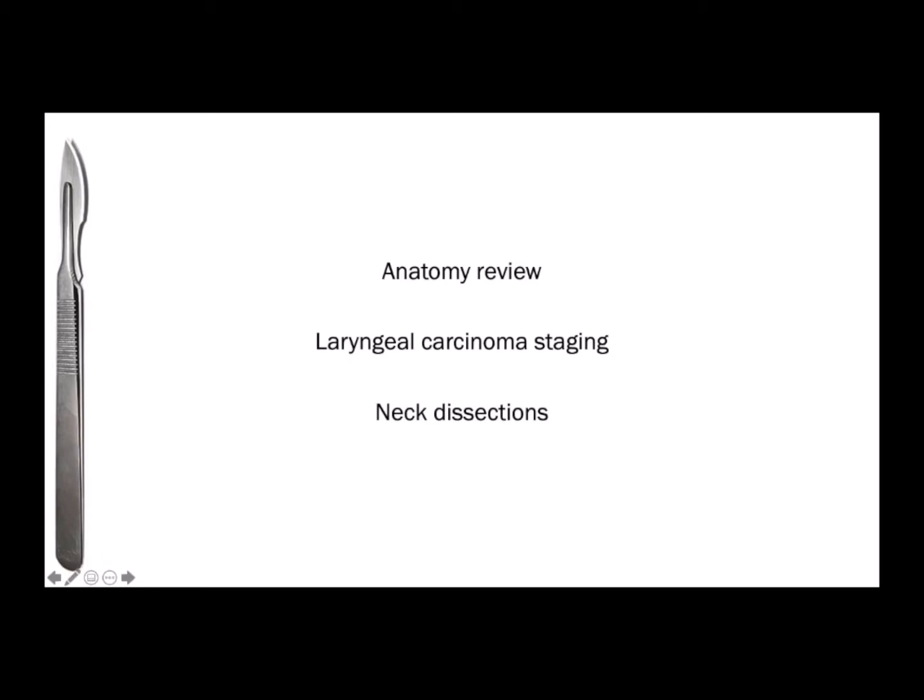Our main goal is to understand the anatomic landmarks and spaces of the larynx and how that affects staging. Something that I find is commonly misunderstood or just kind of overlooked sometimes when grossing larynx specimens are those spaces. And so that's one of the main goals of today.